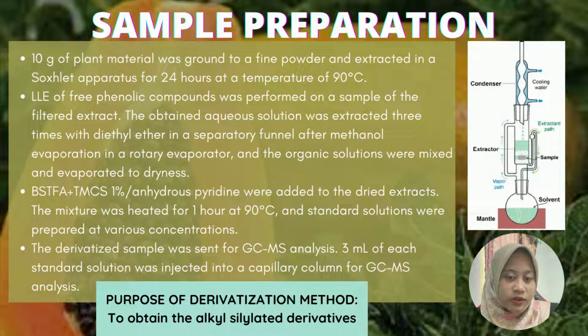Secondly, liquid extraction of free phenolic compounds was performed on a sample of the filtered extract. The obtained aqueous solution, after methanol evaporation in a rotary evaporator, was extracted 3 times with 30 ml of diethyl ether in a separatory funnel, and the organic solutions were mixed and evaporated to dryness.